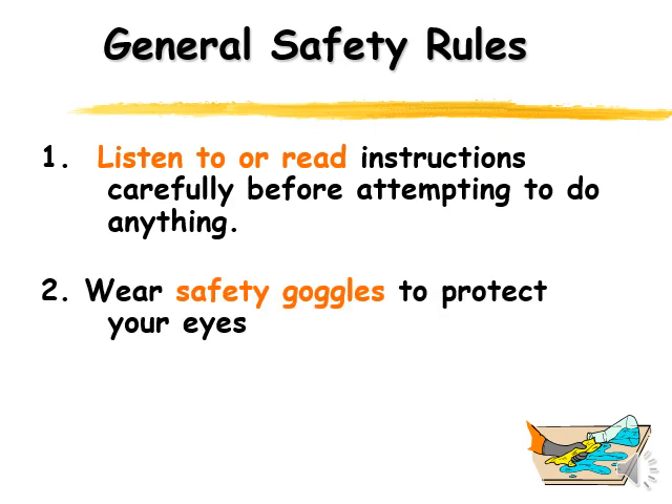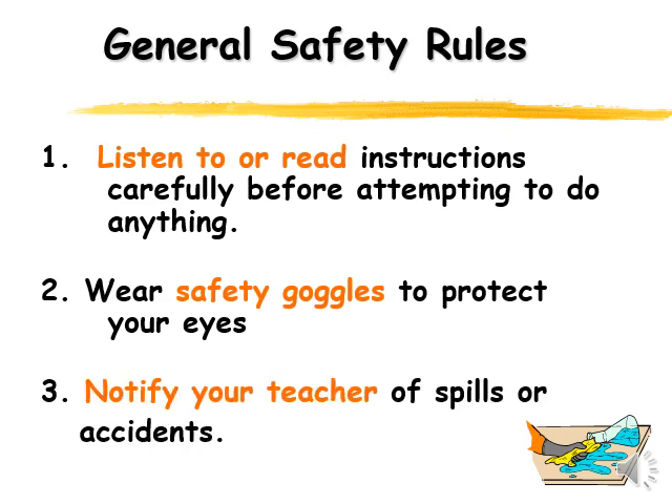Accidents are going to happen, and we're here to help you learn — accidents are part of learning. If you ever have an accident, a spill, or anything like that, just make sure your teacher knows so we can make sure you're cleaning things up properly. Notify your teacher of spills or accidents. It's not a big deal — they're accidents, they just happen.